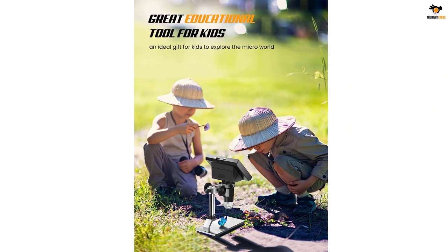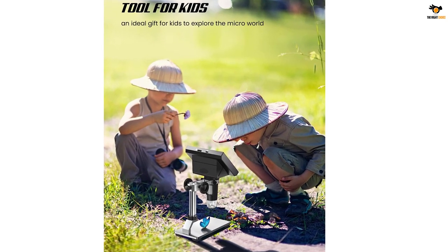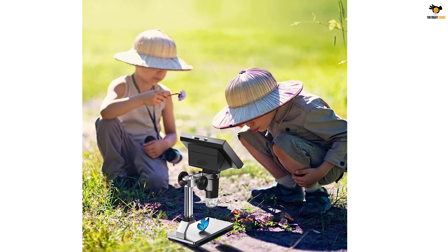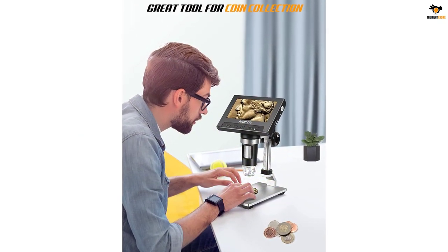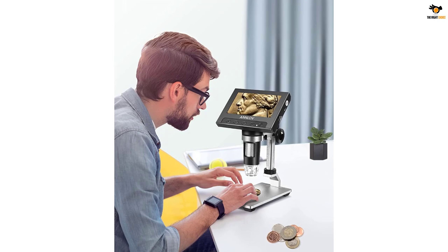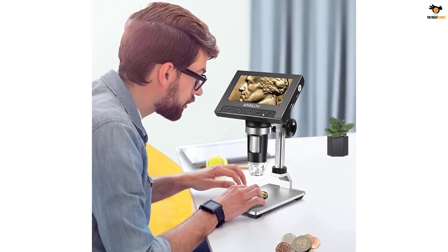The 8 adjustable LED lights built into the microscope have been a lifesaver in various environments. I can easily adjust the brightness from dark to bright by simply sliding the switch. It's been a game-changer when examining objects in different lighting conditions.